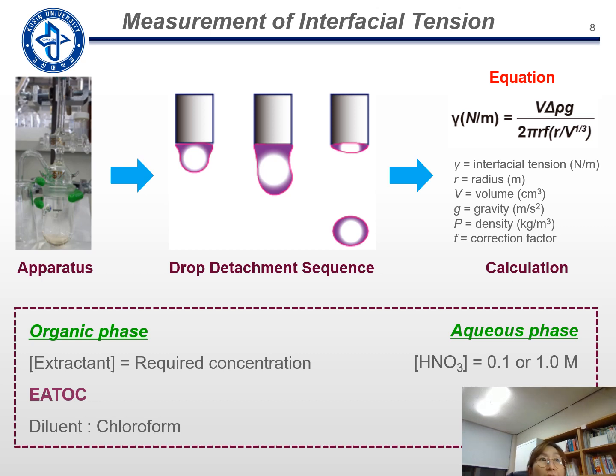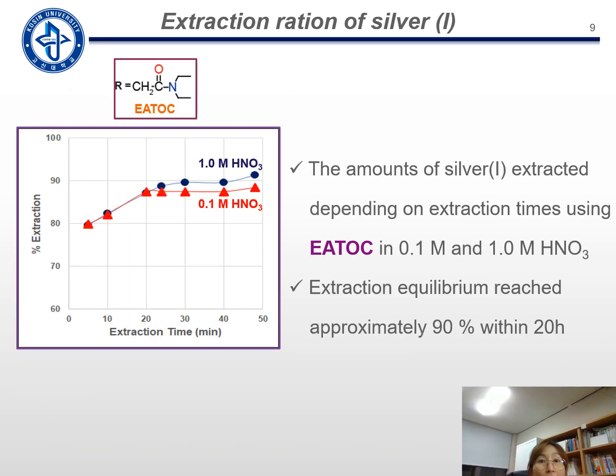And then, in the research work, we conducted measurement of interfacial tension by the drop volume method as follows. From such experiments, we studied the interfacial activity of EATOC. The experimental condition was like this. From now, I'd like to examine the obtained results.